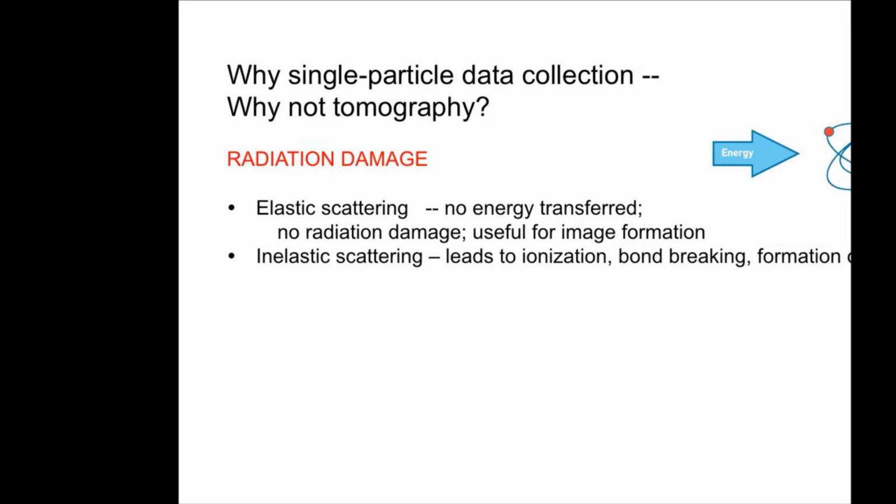Inelastic scattering leads to ionization, that's indicated here. An electron is knocked out, which produces a charge for the entire atom. It's associated with bond breaking and the formation of radicals. Radicals are bad.